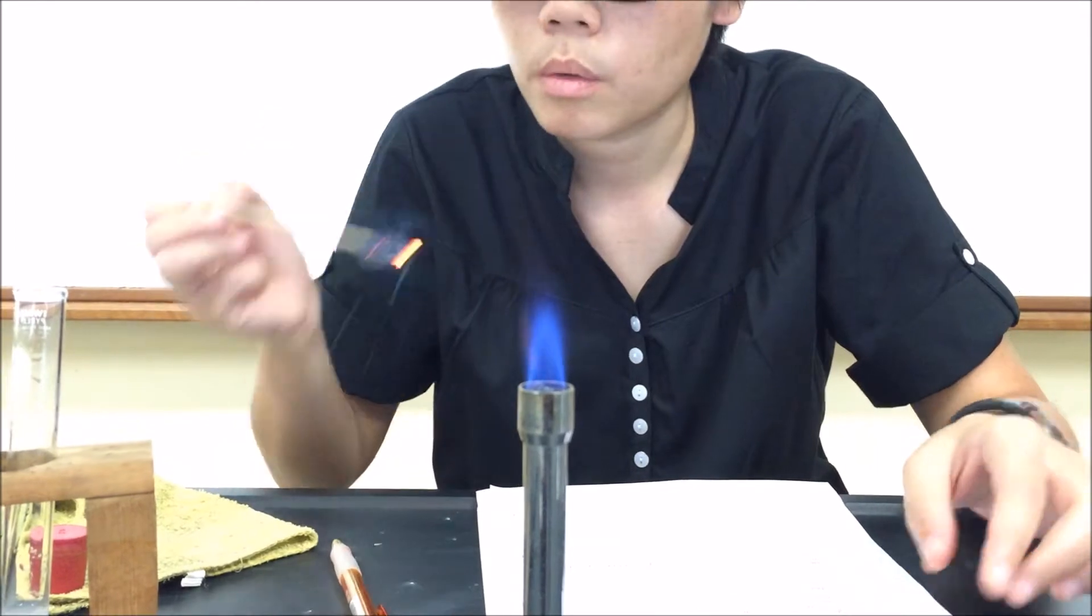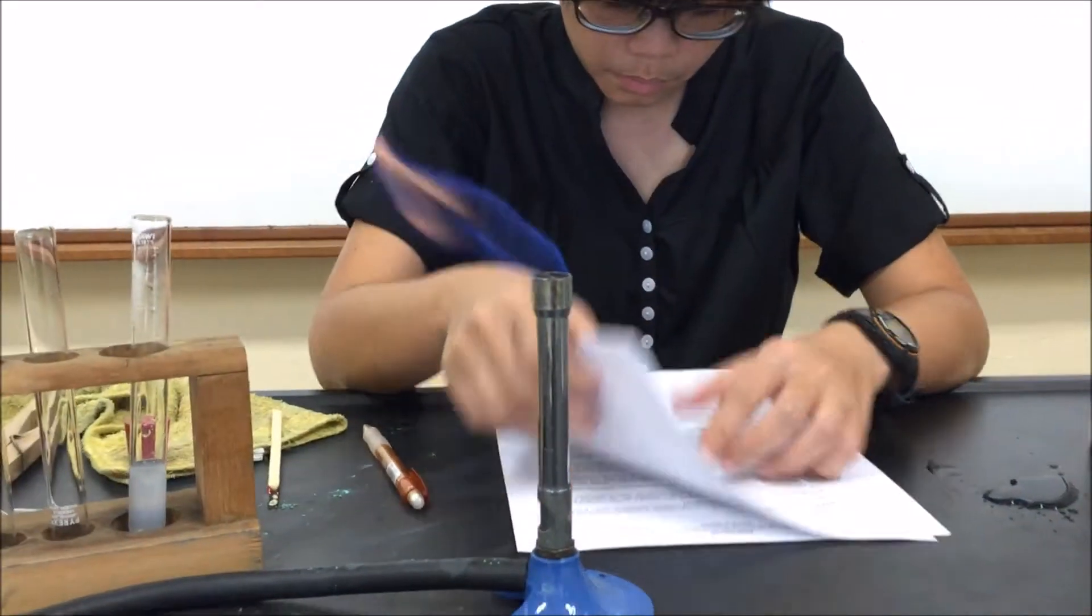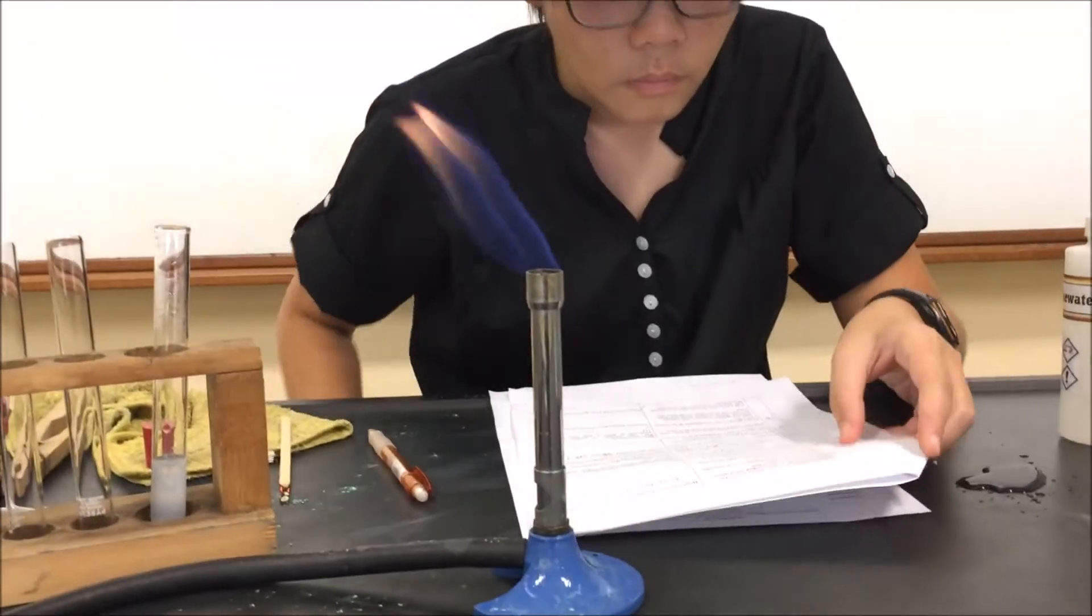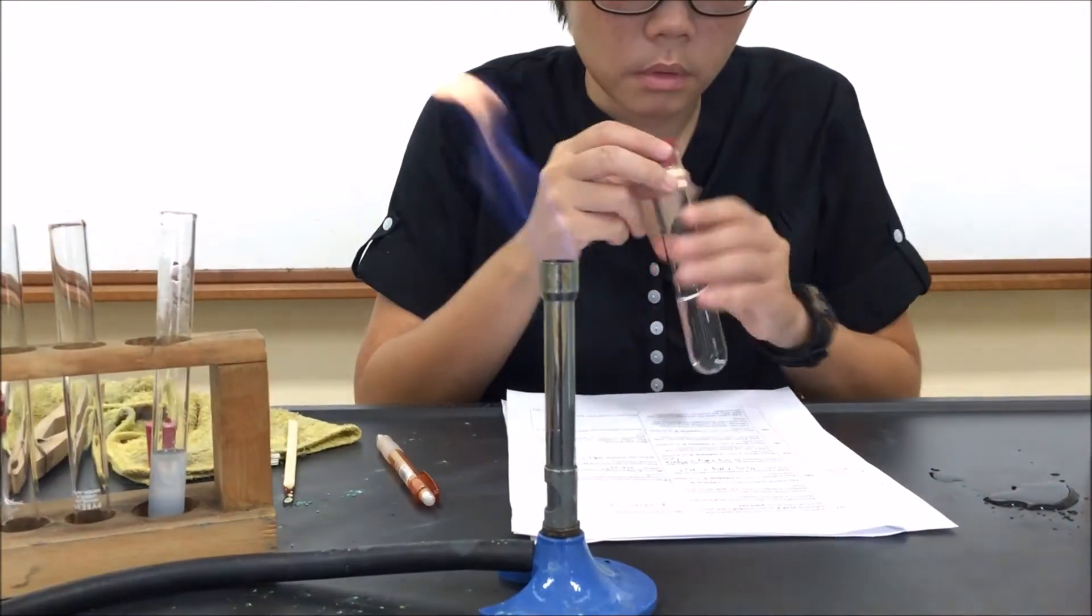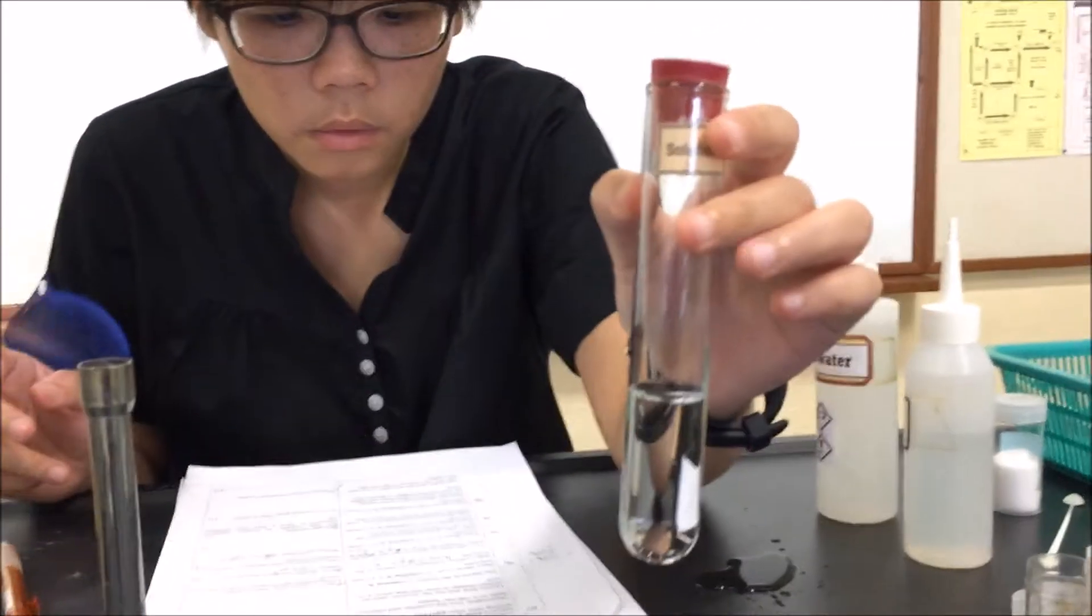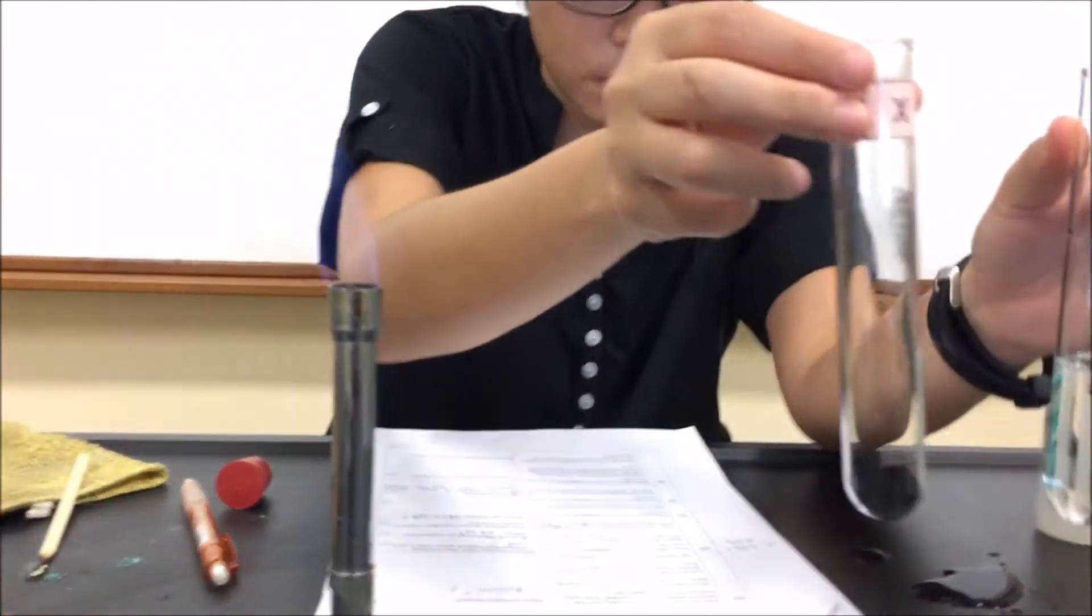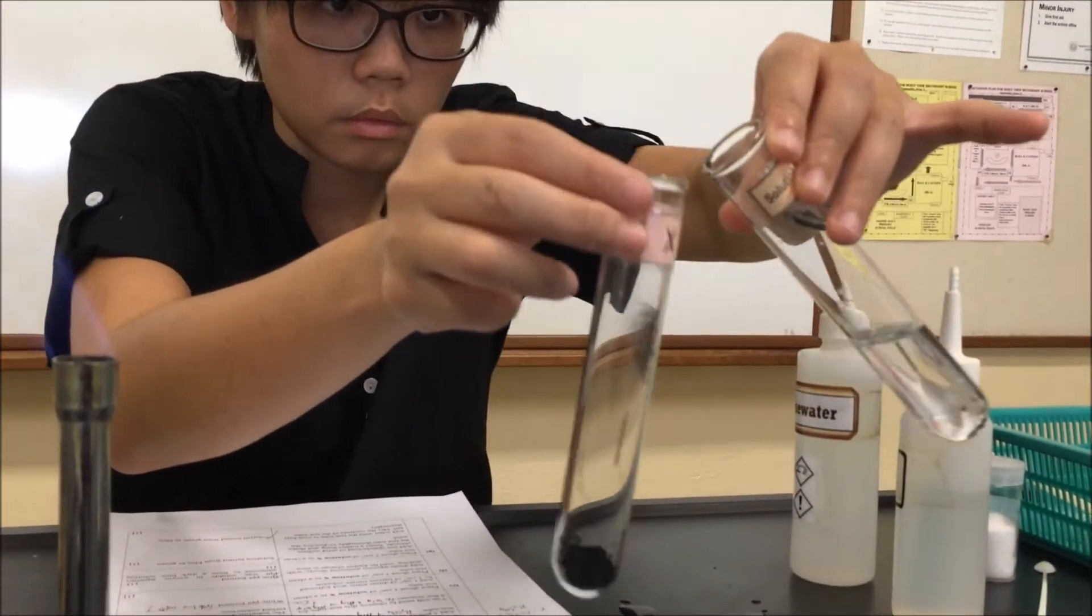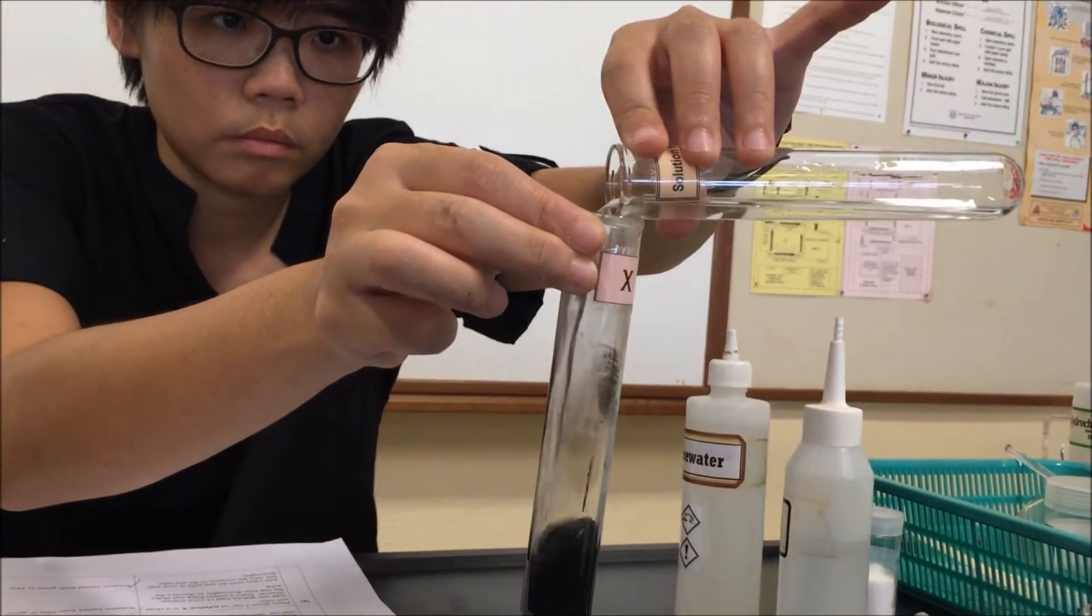Otherwise, we will go on to part C. So close the air hole to get a big flame, safety flame. Then we'll go on to part C where we have dilute sulfuric acid, and we will add the acid to the boiling tube that we have from part A.